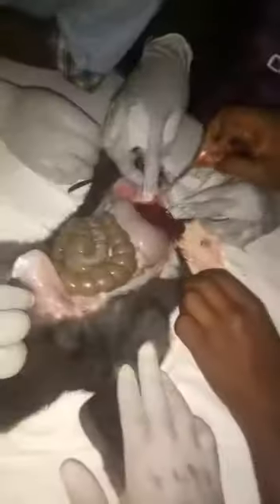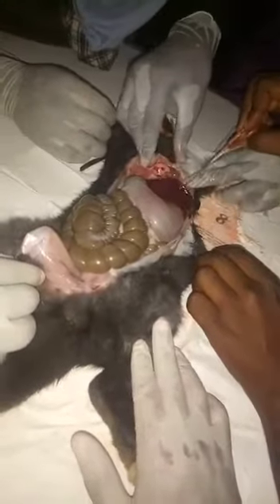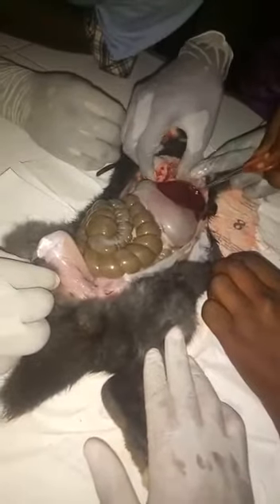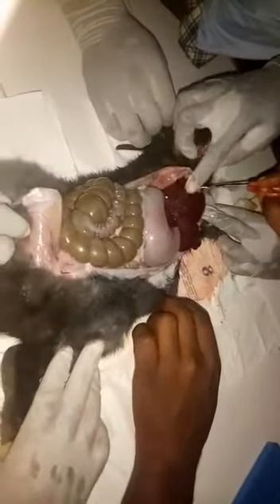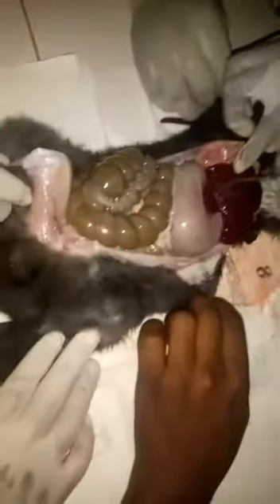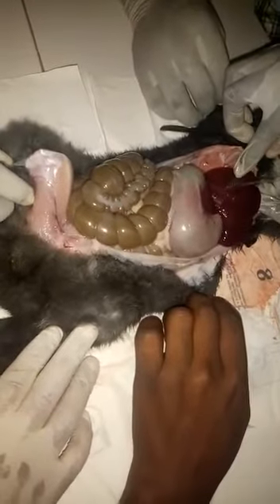Then this is what? Lung. This is the right lung. And this is, look at it here, the left. This is the left lung, isn't it? Good. And this one is small. This is the what? Liver. This is the liver, right? And this green organ is the what? Gallbladder. This is the gallbladder. Excellent.